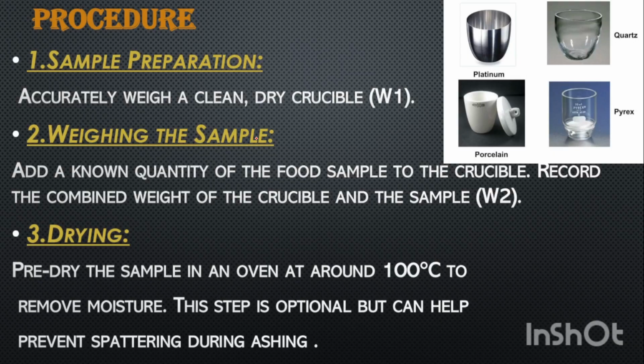Coming to the procedure, in this we need to find out the weight of the clean dry crucible. Place about 2 grams of the sample and weigh this to find out the accurate weight of the sample taken. Carefully place the weighed crucible over an electrical burner or the normal burner. The crucible should be partially opened. The sample will get charred with initial expulsion of smoke.